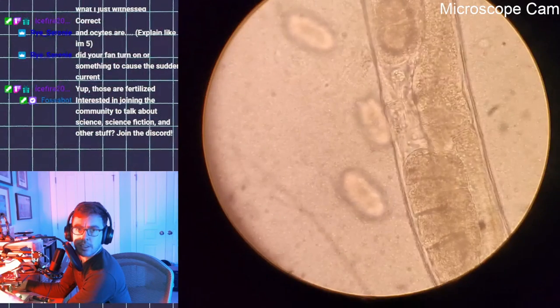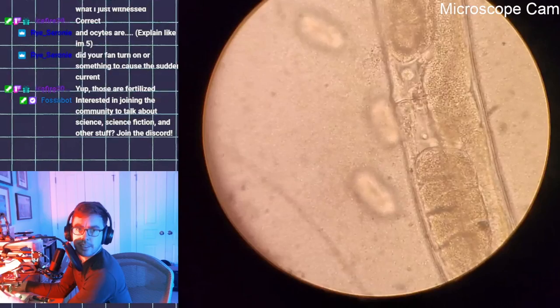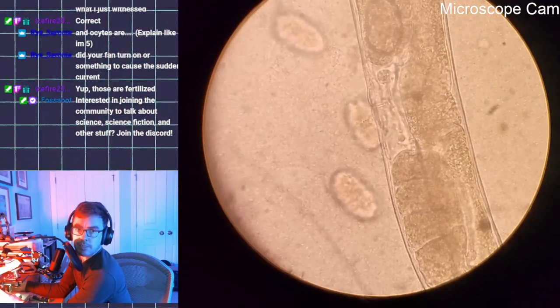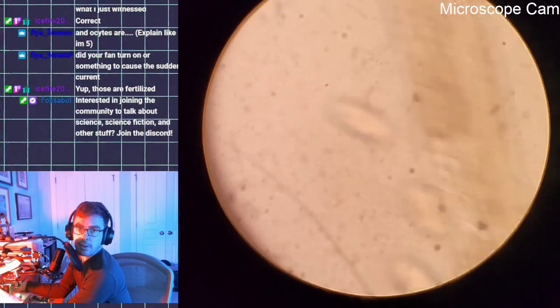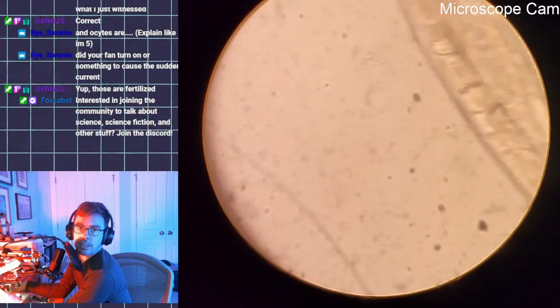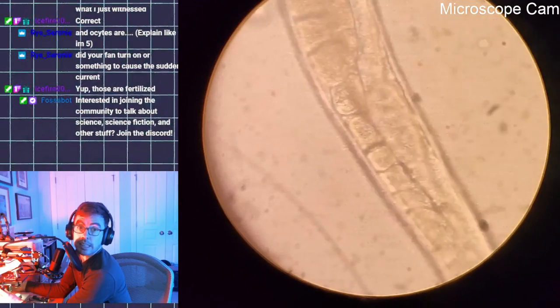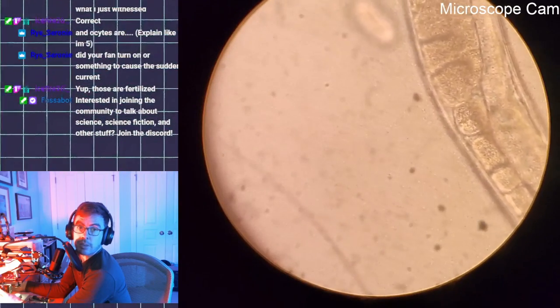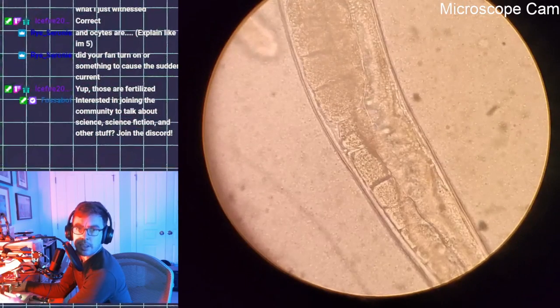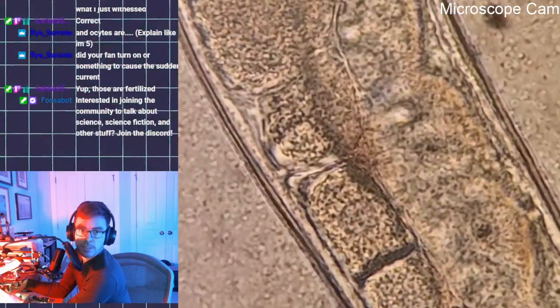All right, she's pushed out like three eggs. I feel like that can't possibly be all that typical. How many eggs do they lay per minute, per second? Oh, yeah, look. You can see the clear transition from oocyte to embryo. That's cool. It's pretty obvious now that I'm looking at it. Where the transition specifically is, I don't know.